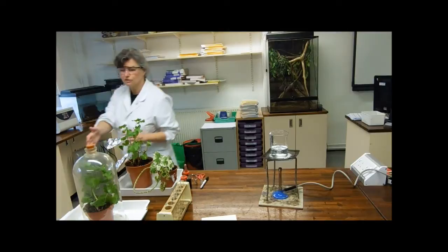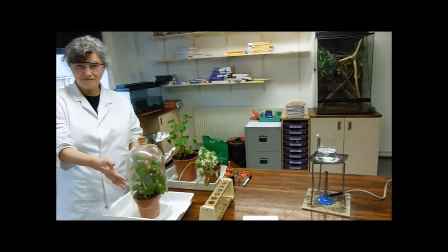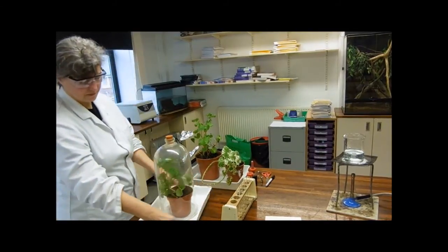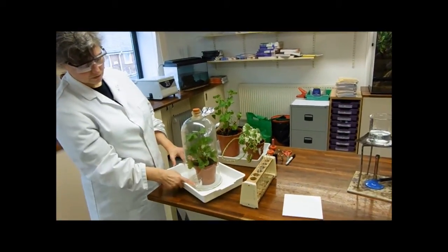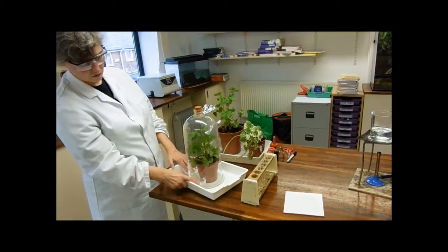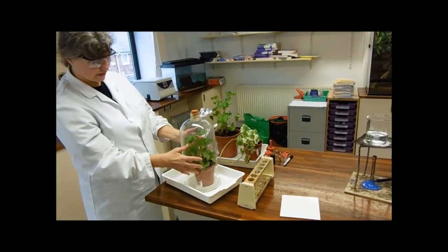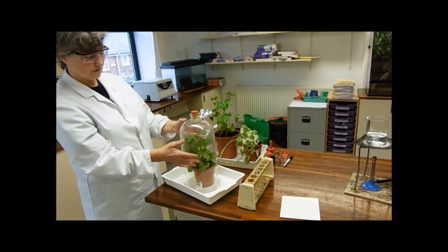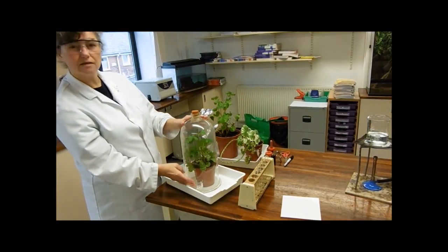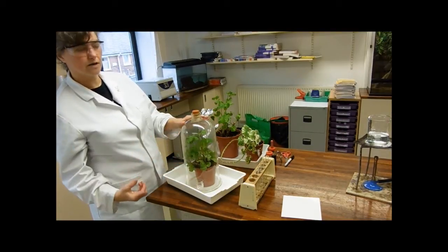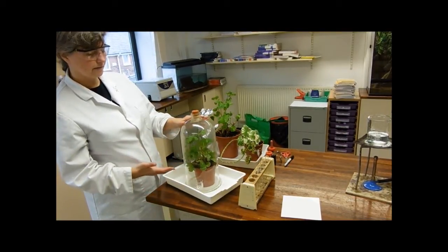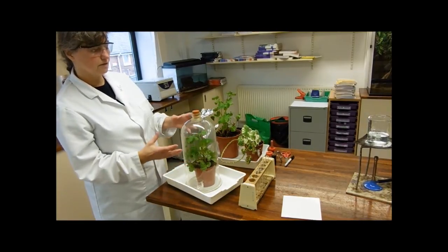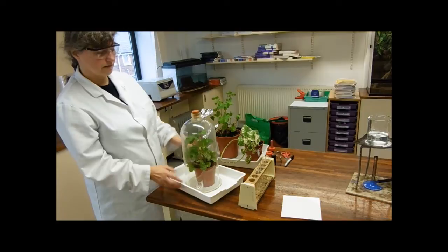Finally, in this super-duper bell jar here, we have a little jar here of potassium hydroxide pellets. This bell jar has been sealed to the tray with Vaseline, so inside of here, the potassium hydroxide is taking away the carbon dioxide. If this plant needs carbon dioxide to photosynthesize, it's going to show that it's not.